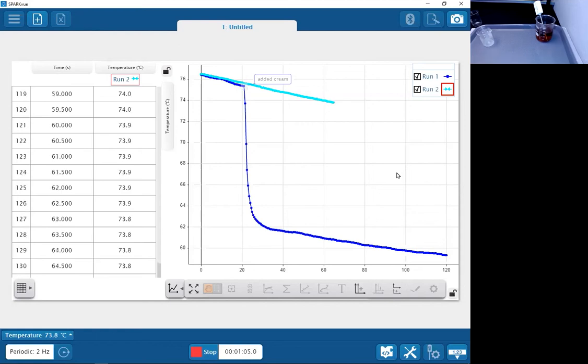All right. So we're going to talk a little bit about the table in the third activity. I don't find a lot of value in the table when we have a lot of data points, hundreds of data points as we do here. But there are experiments, as we'll see in the third activity, when you're just collecting a few data points, and the table can be integral to that. For activities like this with hundreds of data points, I find the graph very handy to use. Allows me to see the entirety of the behavior.